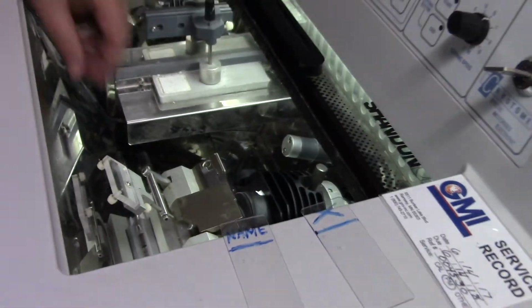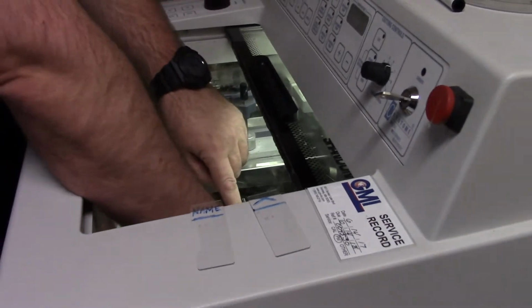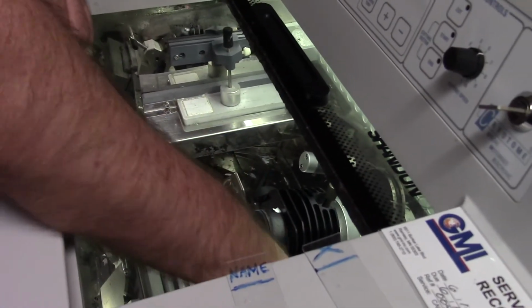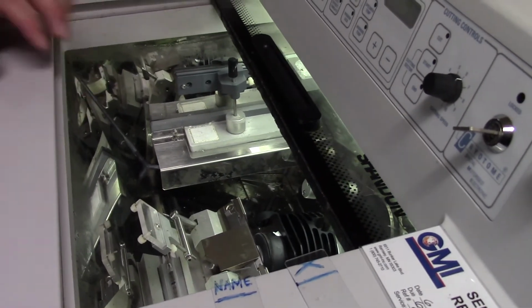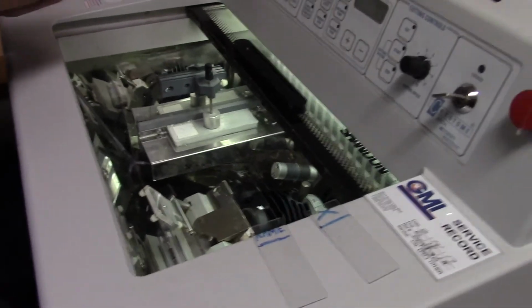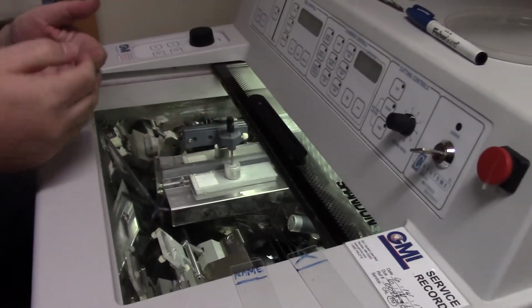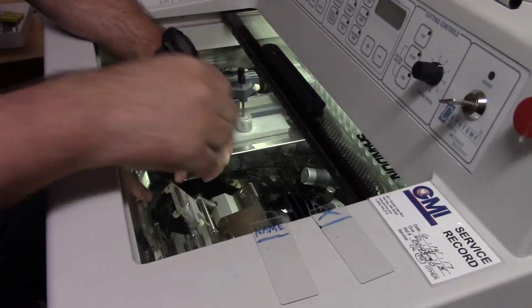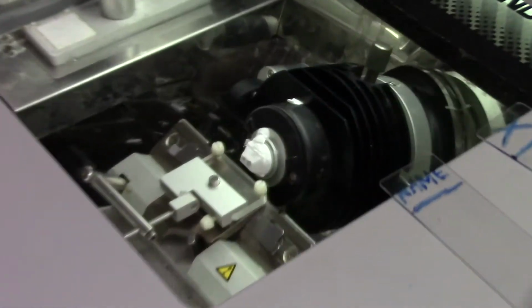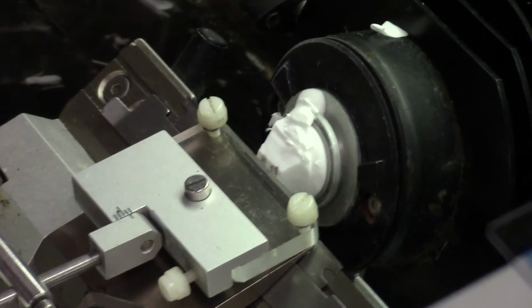So next I want to go back. Well, I can see some snowflakes there. Let's make sure they're out of the way before I take the next section, because those snowflakes can be little bits of frozen OCT that can act like a speed bump. And then as I try to cut the piece of tissue, it'll get snagged on that and won't be completely straight. So I want it to lie flat, so I'll take the next section.